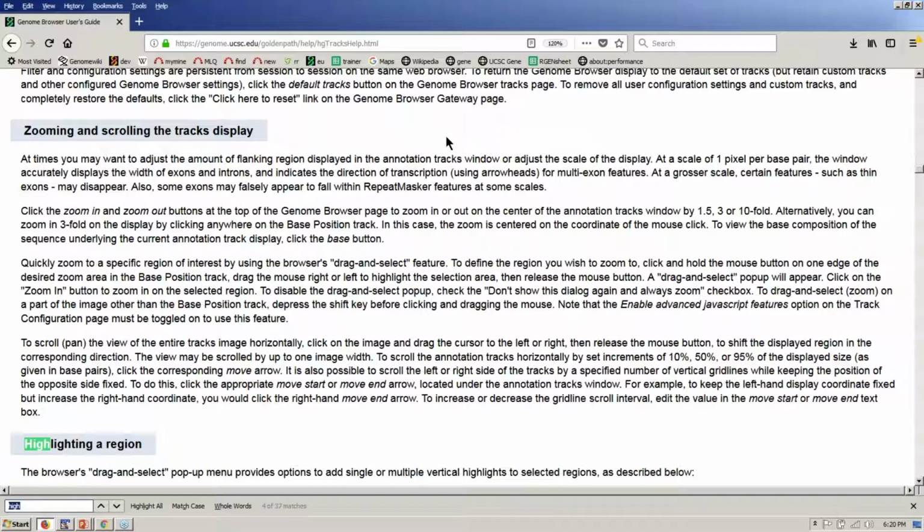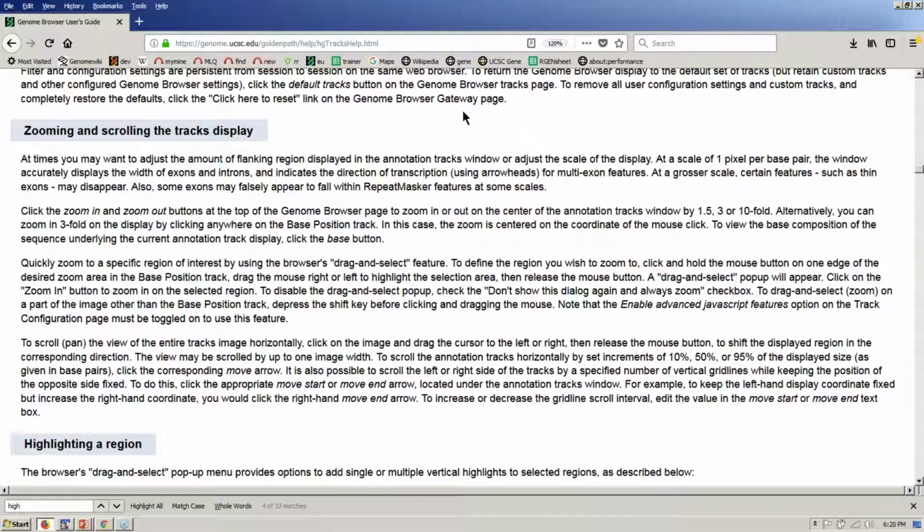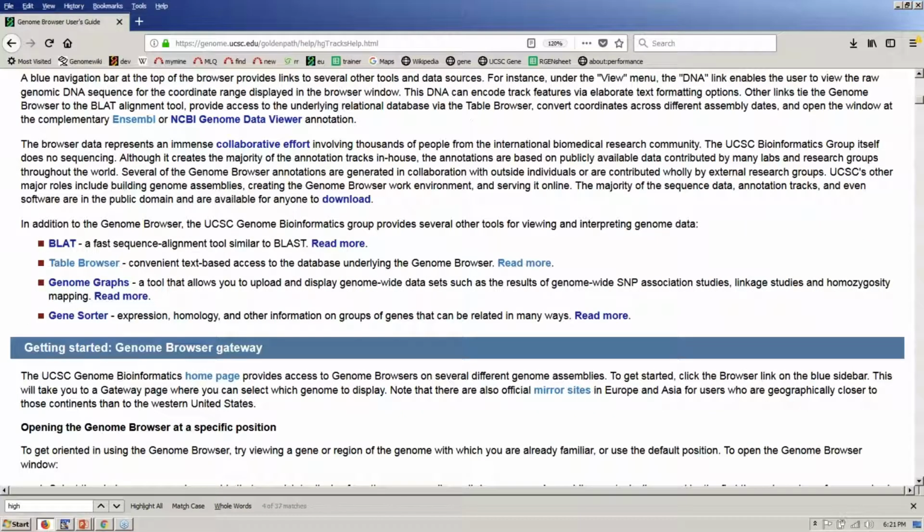Great. We have another couple of questions that are somewhat related. One of them is, is it possible to analyze sequences that are not stored in the UCSC browser? Somewhat related to that, quite a few people have been asking about uploading their own data, sometimes loading whole genome BAM files, 180 to 200 gig in size. Someone's tried that, but it takes ages for uploading. So the question is, are there limits about uploading your own data, and what types of your own data? Yeah, there are.